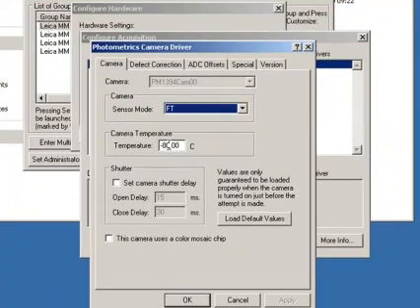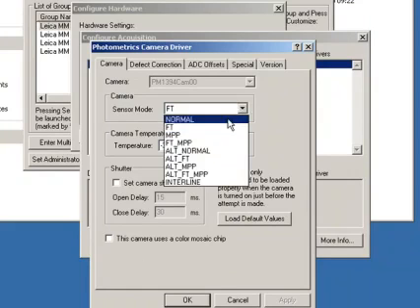If it isn't installed, drop it across. So a couple of quick things here. We've obviously got this thing that says FT. We'll change that in a minute, and we have the temperature. The temperature we're just going to change to be -30. This is a CoolSNAP operating here, so pretty straightforward.